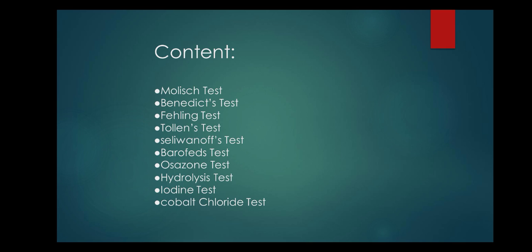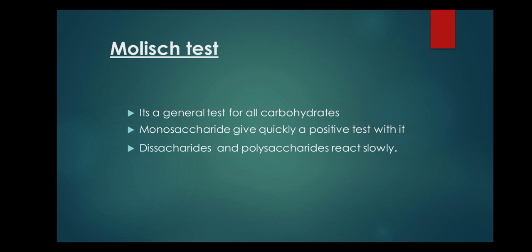First of all, Molisch test, then Benedict test, then Fehling test, Tollens test, Seliwanoff test, Barfoed test, Osazone test, hydrolysis test, iodine test, cobalt chloride test. First of all, I will explain the Molisch test.